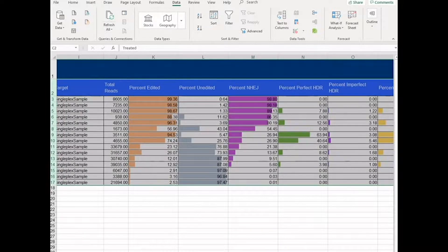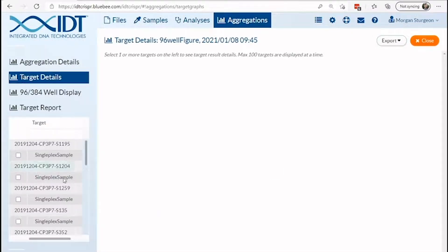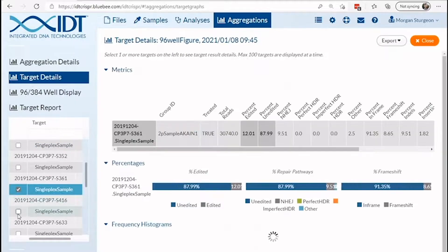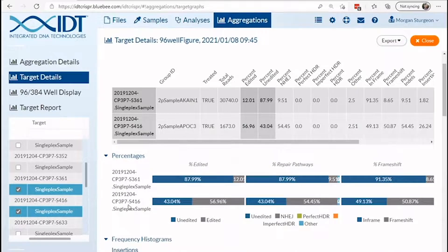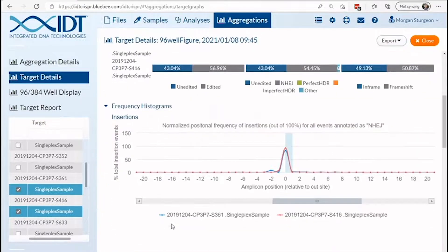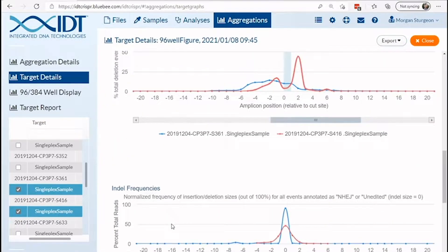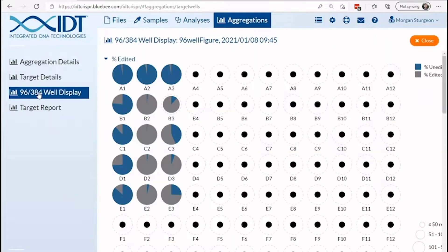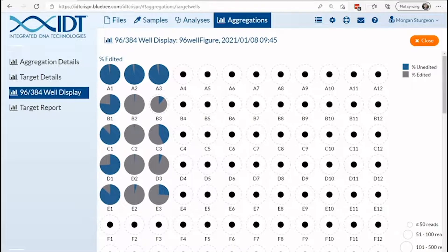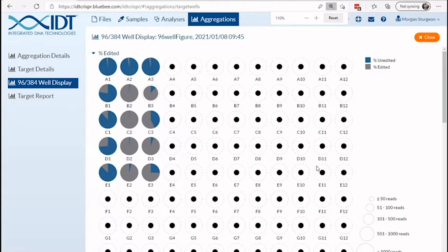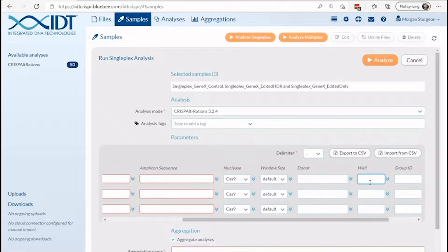In addition, all samples can be compared to one another by clicking on the target details page. Here you can find the same graphics available for an individual sample, but now can overlay results from other relevant samples within the experiment. For screening a large number of guides under varying conditions and treatments, you can generate graphics in 96 or 384 well plate format to find optimal conditions quickly. Specify well information for each singleplex sample prior to sample analysis.